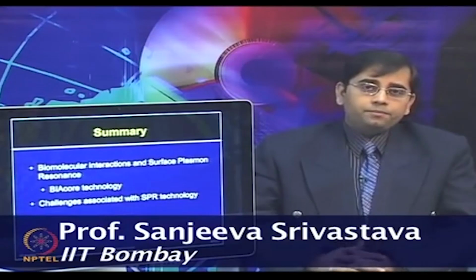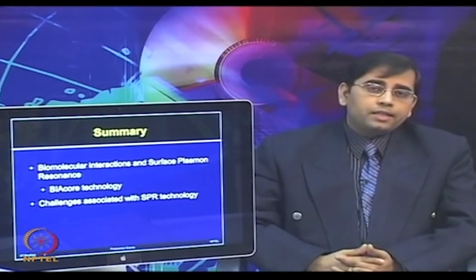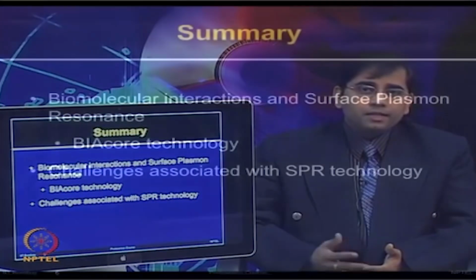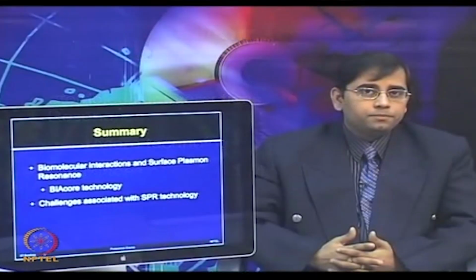So, in summary, in today's lecture, you have learnt about the significance of studying biomolecular interactions, how the surface plasmon resonance technique can be used for studying biomolecular interaction, a brief introduction of Biacore technology and data analysis, and then certain issues and challenges which are associated with SPR technology.